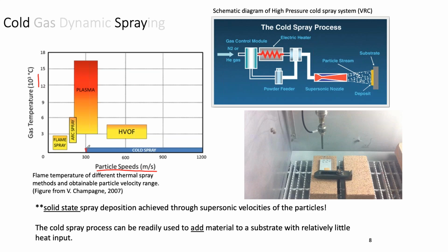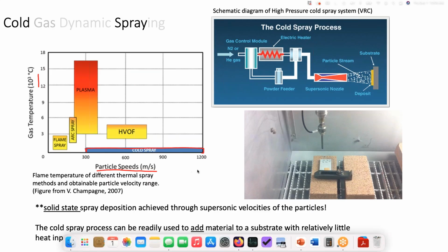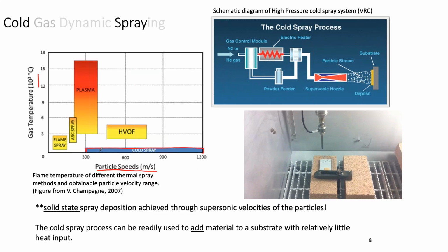Cold spray, the name cold implies that we're actually not melting the particles, at least not completely. And what we're doing is we're trading thermal energy for kinetic energy so that they're moving at a couple times the speed of sound. And so when they hit, you basically have a micro explosion welding event that bonds them more or less instantly to the substrate that they hit. We'll talk more about what that means in a minute.